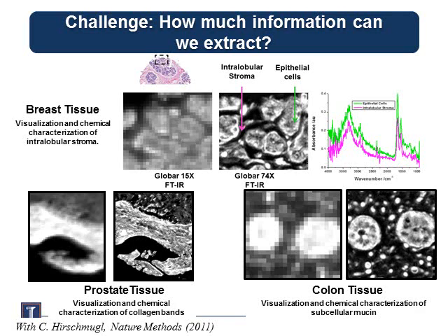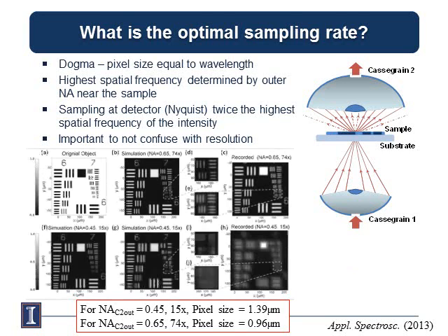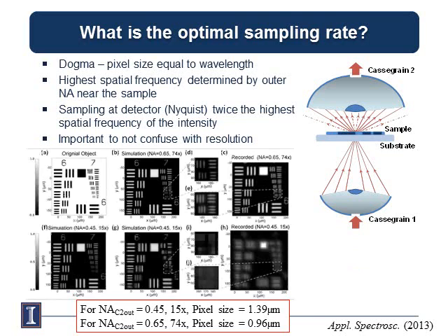So this, what we call high definition imaging at that point, is now fairly routine. There's actually a paper that came out earlier this year which tells you why and how you're able to get this sort of imaging. But I just want to reiterate that point: this is due to a number of factors. It's due to using a higher NA lens. This is the recorded data with a lower NA lens, and this is the higher NA lens. So we used a higher NA lens, number one. But the second thing that we did that was interesting here was we used the appropriate pixel size for the data that we were recording.